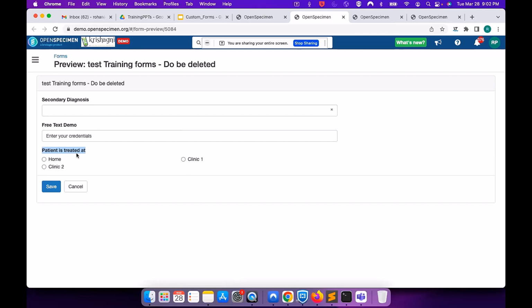So we have elaborated wiki pages around this feature, and you can go through them and just let us know in case you have any questions. I think this is a pretty simple and straightforward module, and it is just a matter of time before you can do this on your own. But in case you have any questions, feel free to reach out to us. If we have any specific questions to discuss today, we can start doing that.